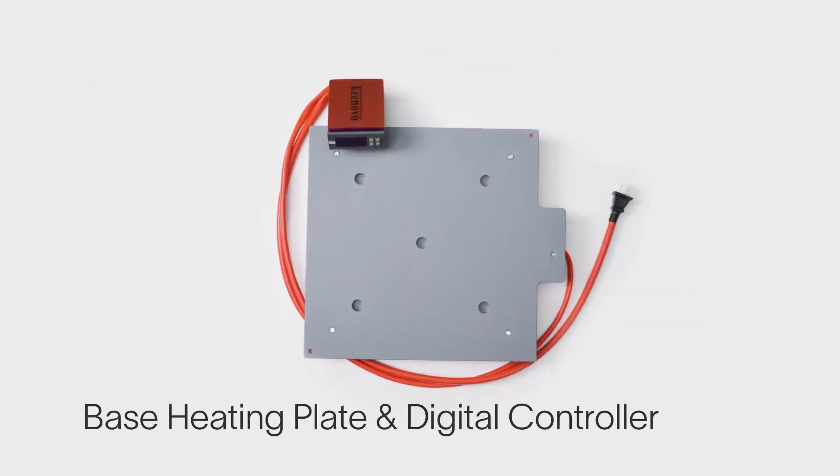Here we have the base heating plate. This feature is what makes this mold innovative in its ability to heat the preparation without the need for an oven.